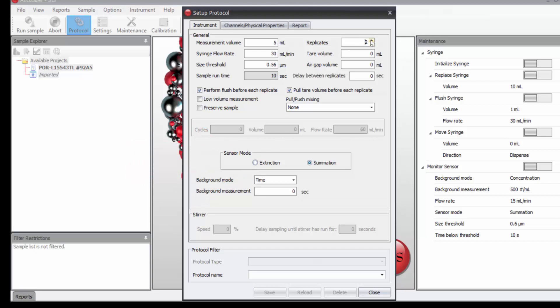The official protocol requires running four measurements. We discard the first and then do the average of the second through the fourth. We'll make a tier volume of 0.5 mL. We don't need an air gap or a delay.